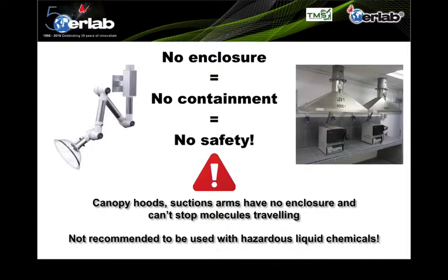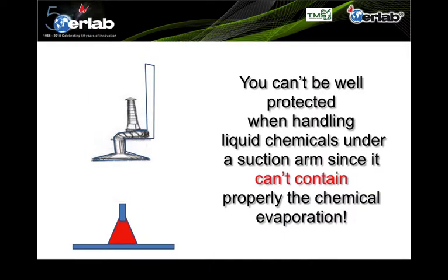Basically, canopy hoods and suction arms have no enclosure, and they can't stop chemical molecules from traveling. They may have other uses, for example for furnaces, but not for liquid chemicals and gases. It's not recommended.